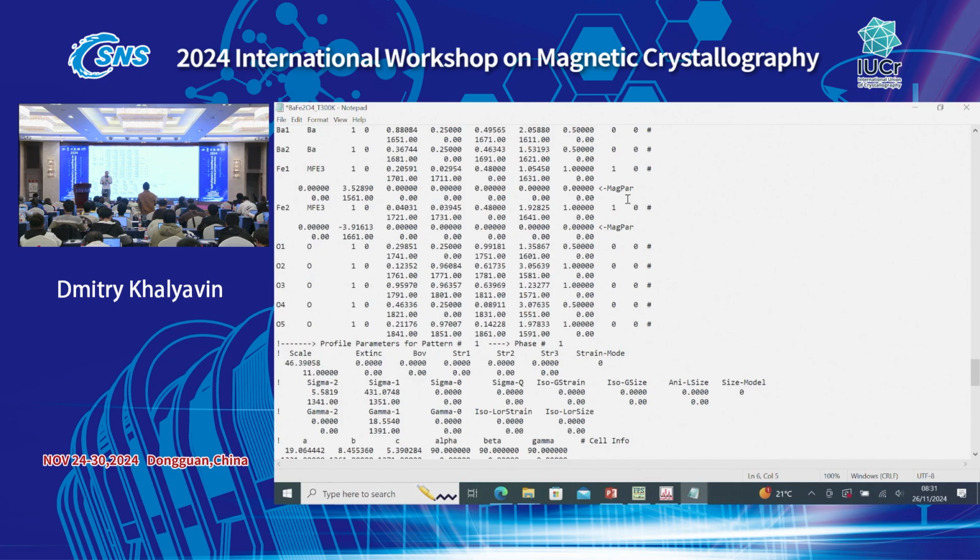Oh, okay, yeah, I understand. So it depends on the situation. I cannot tell you, maybe you are right, maybe it is the case of two phases, but again, you can easily have a situation where you have two propagation vectors in the same phase. Okay, thank you. But if it is two phases, you should be using these two magnetic space groups. In theory, you should be able to refine your data.